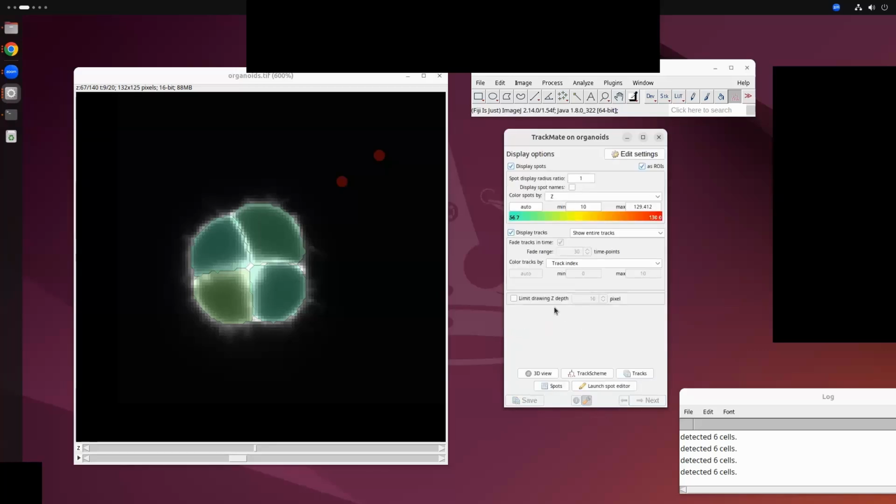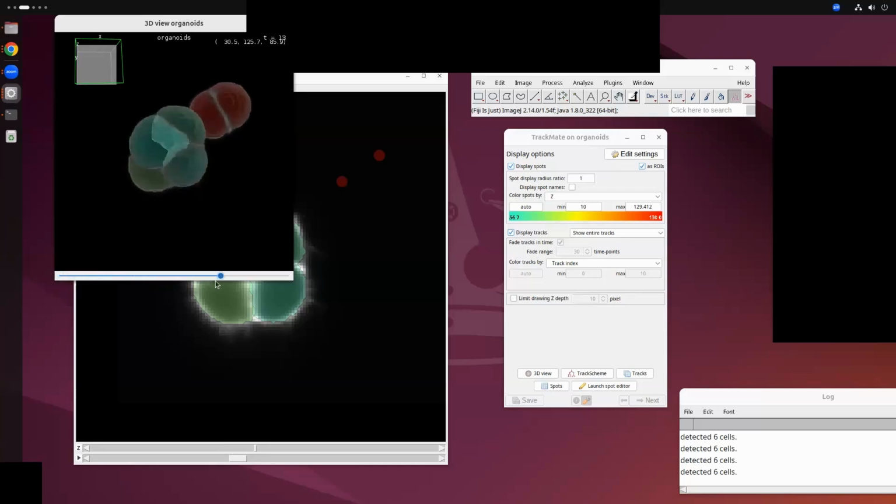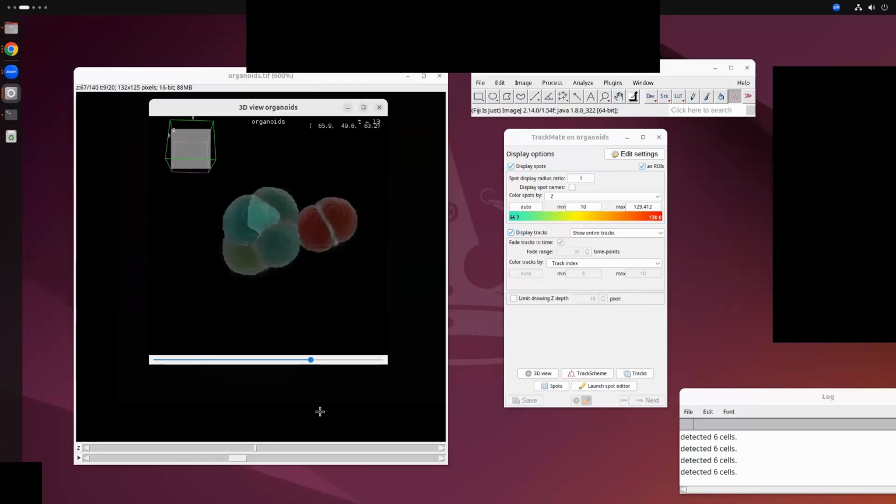At any point, you can go to this view window and look at the 3D view of how the current segmentation looks at the current frame. This is just to visualize how the segmentation works with the 3D rendering engine. This is rendering on your computer, not on the back end, so it depends on the rendering speed, and on whether you have a display card that can do some kind of rendering. But typically this does not require that much computational power, unlike deep learning-based modeling. So this is running on the front end.